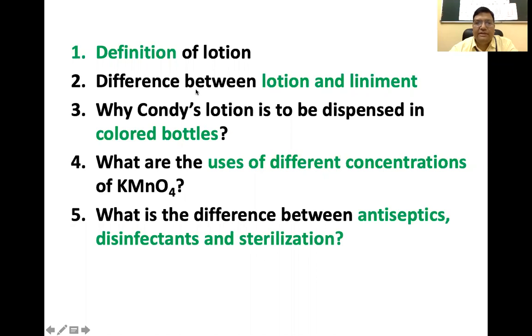So for this preparation, you should know what is the definition of a lotion and what are the differences between lotion and liniments, why we are going to dispense this preparation in colored bottles, what are the uses of different concentrations of potassium permanganate, and what is the difference between an antiseptic, disinfectant, and sterilization process.